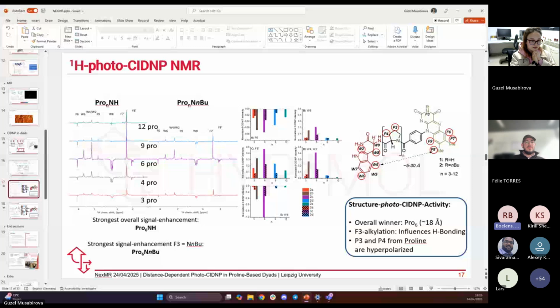Trans and cis will have different J values. So that means also in this case, an exchange integral will have an orientational effect. Does that mean that in your case, since you have such nice distance dependency, all the bonds more or less are rapidly rotating so that the orientational effect is averaged out, or how should I interpret it?